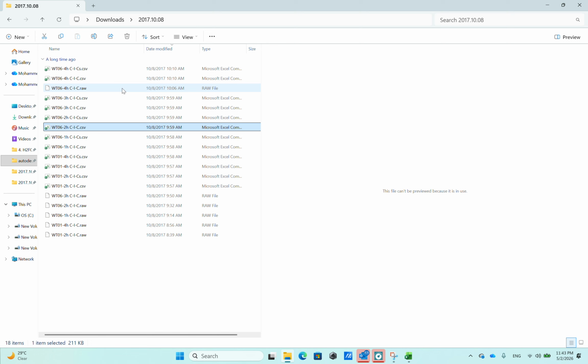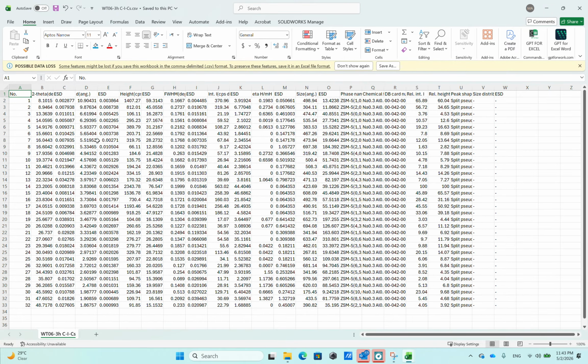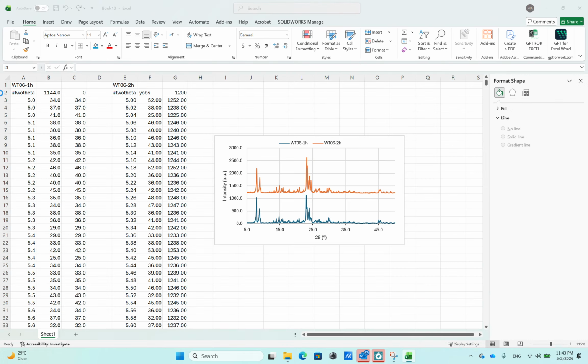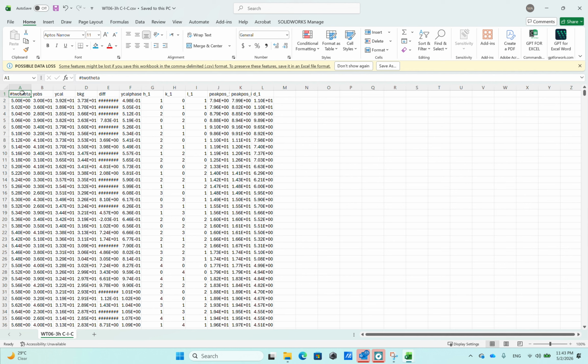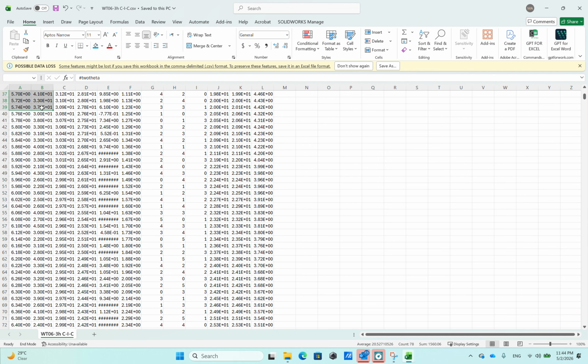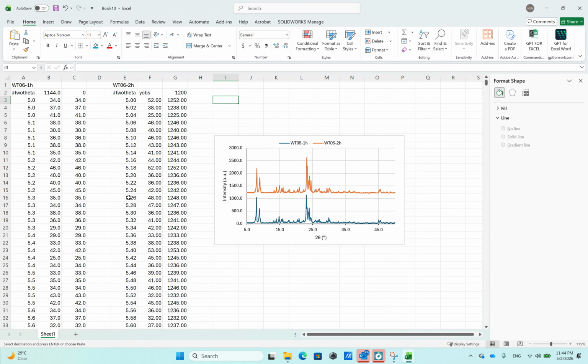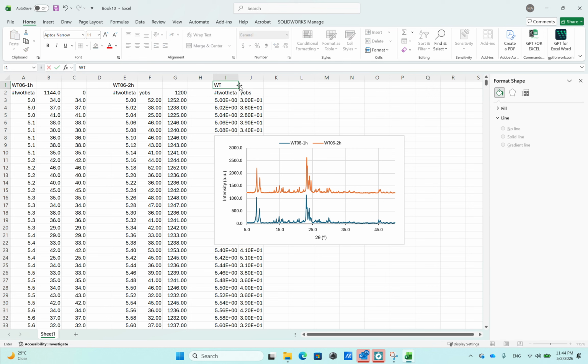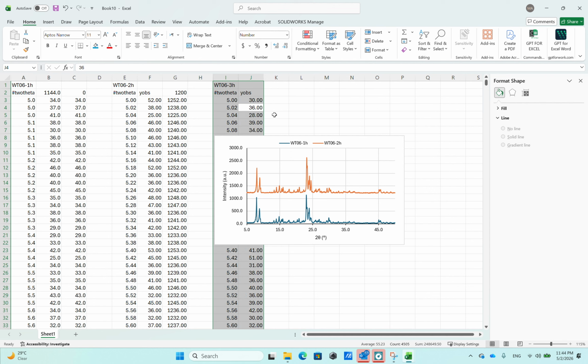Now let's add one more sample here. This is done. We took 1 hour, 2 hours, let's take 3 hours for the same sample. Again, we click on this sample and we paste it here. The sample name is WT06-3H. You can highlight this if you'd like to change it to a different number format.